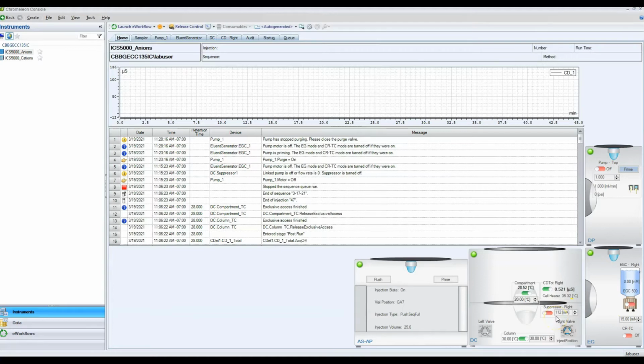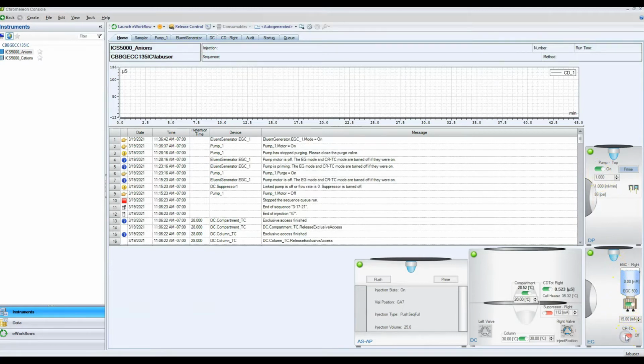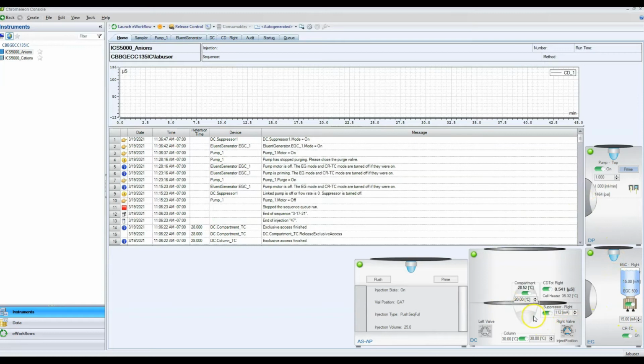For the most part, everyone is going to be running with the same settings, and it's easier to just write down what they are. For anions, which we have open right now, we're setting this to 1 milliliter per minute flow rate, and we can turn that on. We need 15 millimolar eluent concentration, and we turn both of these on. And then we need our suppressor set to 112 milliamps. Now, these numbers may be different for you if you're running some special type of analysis, but for the most part, this is what we use on this instrument.